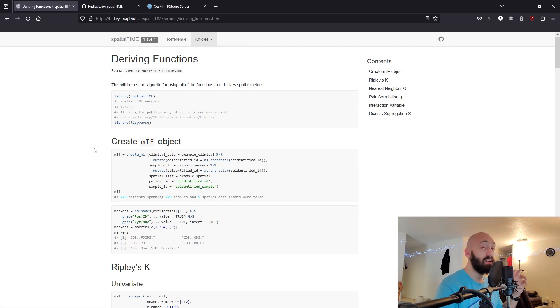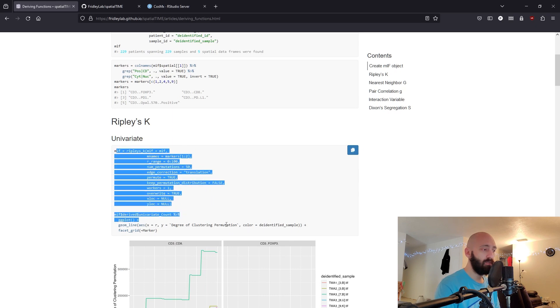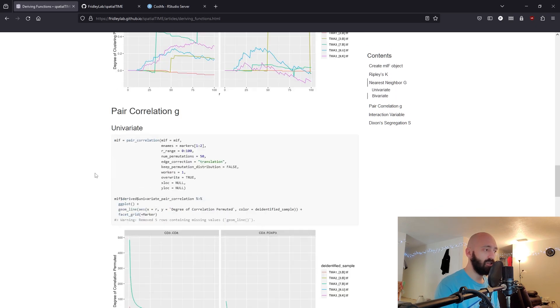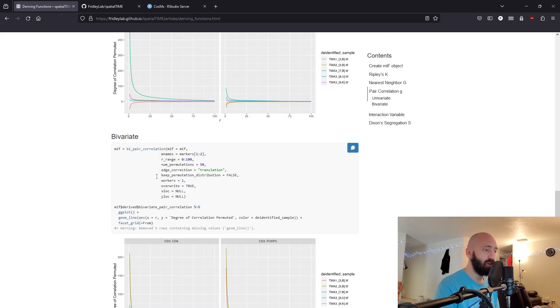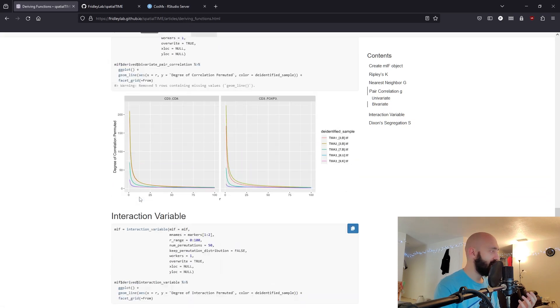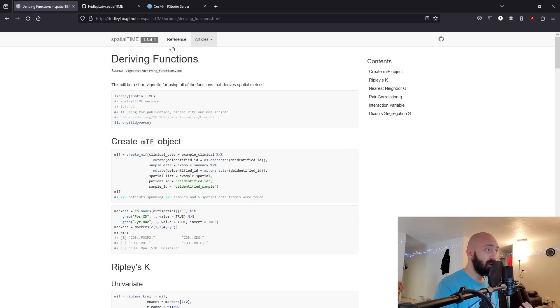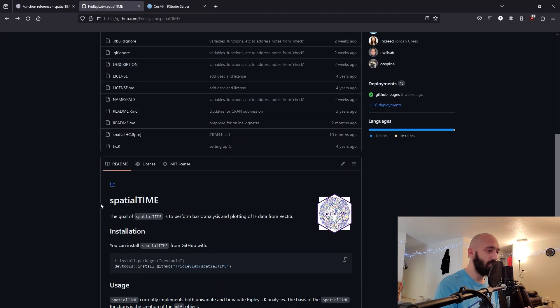The deriving functions vignette doesn't have much explanation about what the values mean, but it shows you how the functions work. I actually ran into an error with the bivariate pair correlation — it doesn't work on my Windows computer but it worked on my Mac for some reason. This is that vignette.